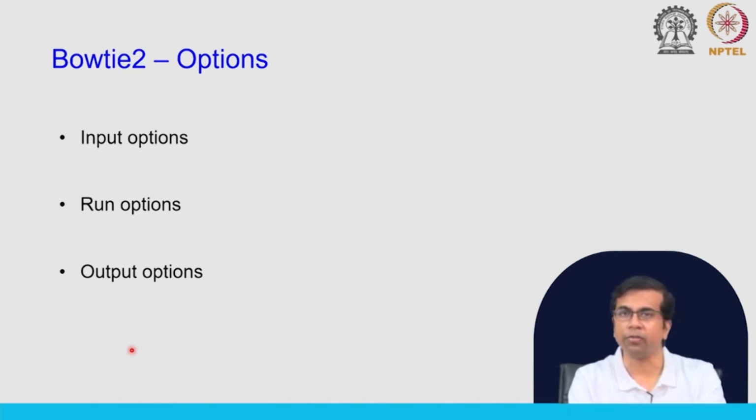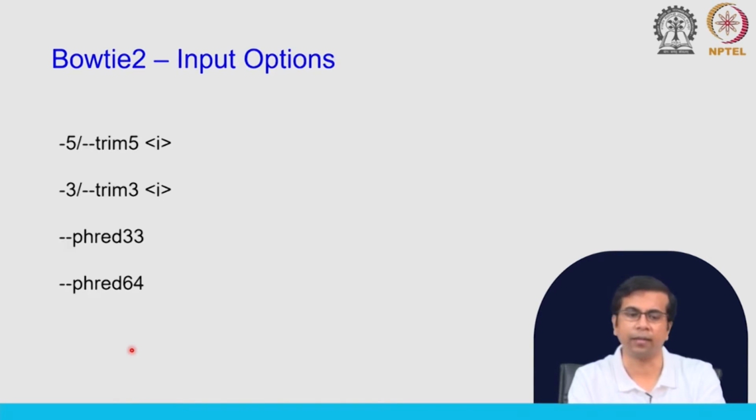I introduced them in the last class or so, so I will just summarize some of these, because what we will do today is start using them. I will show you how you actually use them and what kind of effect you will see on the data analysis.